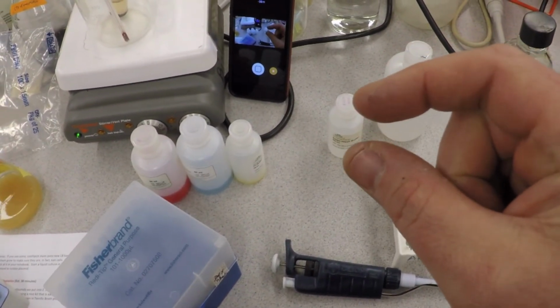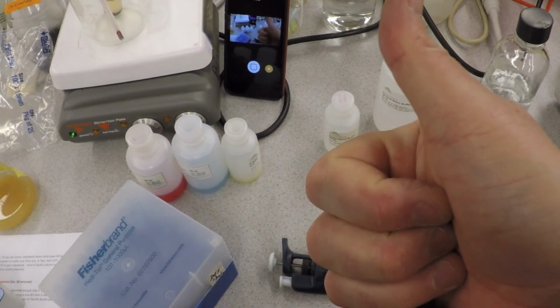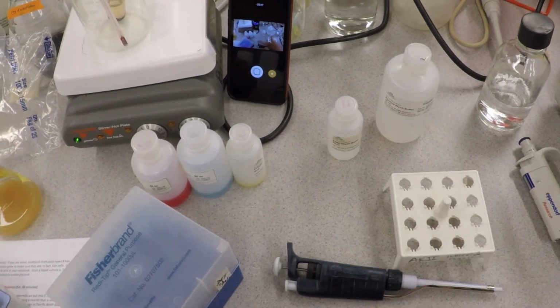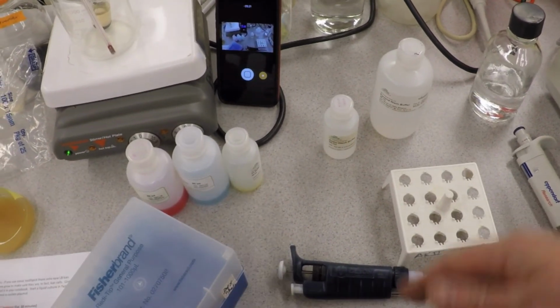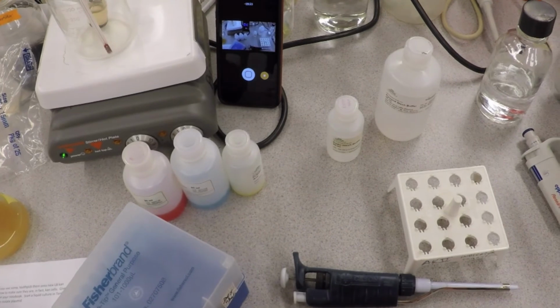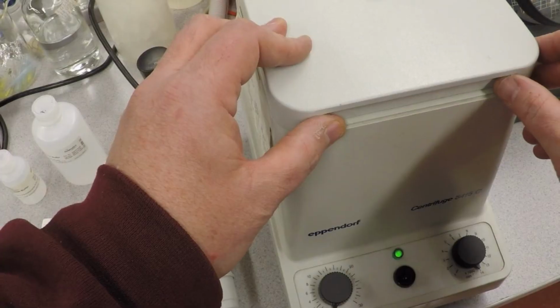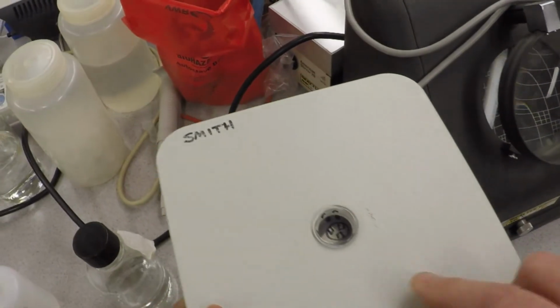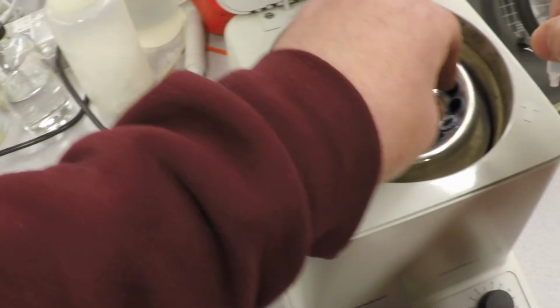And now you will take it over and find out how much DNA you have and how pure it is by putting it into something called the NanoDrop. Okay? And that's very easy to use. We'll just use that when we do our thing in class. Okay? I won't show you that on video. I put that little face on there when I bought this centrifuge in 1998. It's still there.